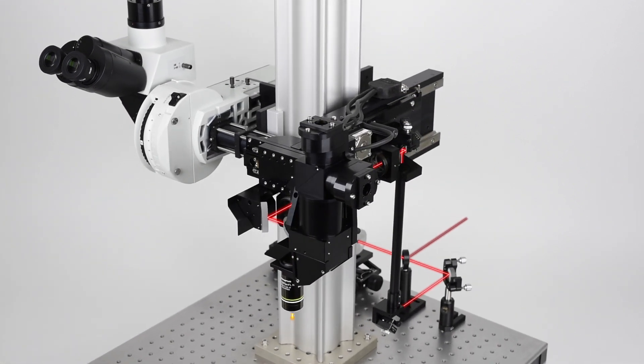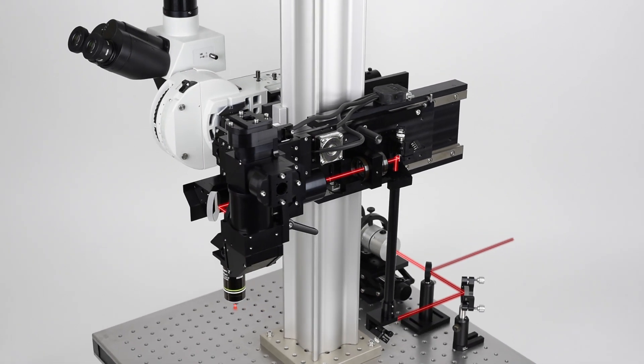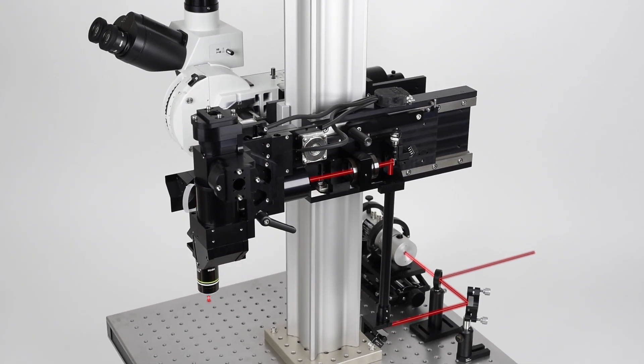Two separate laser beams can be arranged on the optics table with individual Pockel cells and recombined into the system as well. In this case, the two beams can be independently modulated by the software for simultaneous multi-line excitation, fast photomanipulation, such as optogenetic stimulation, or molecular uncaging.